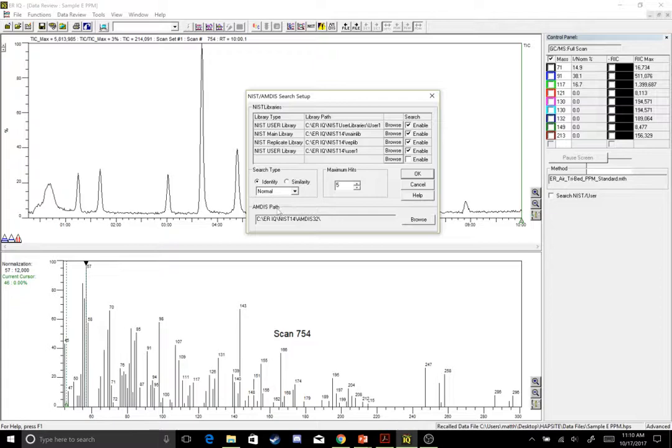And while you're here, you can also look at your AMDIS path. So here I have C, ERIQ, NIST 14, AMDIS 32 set up right here.